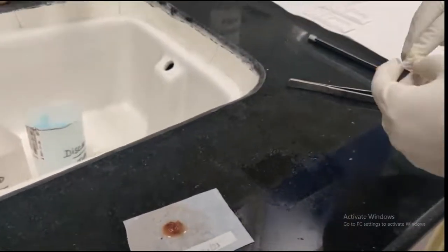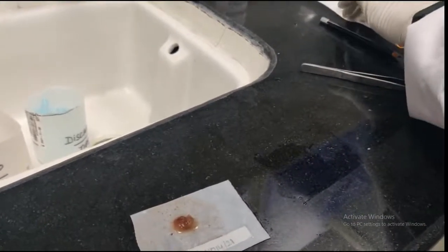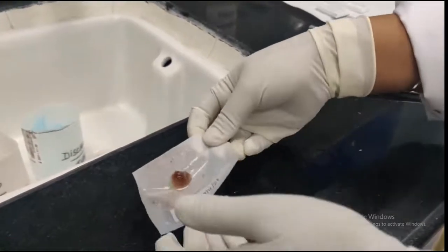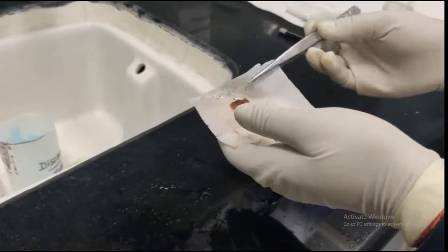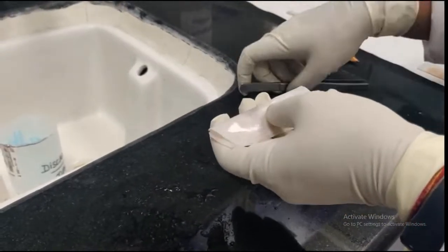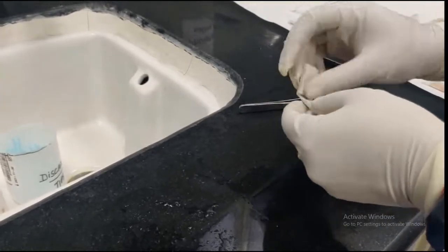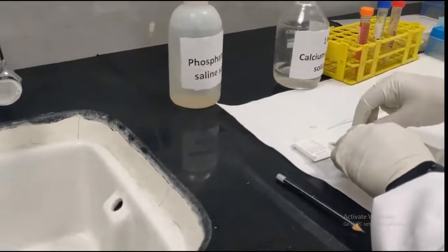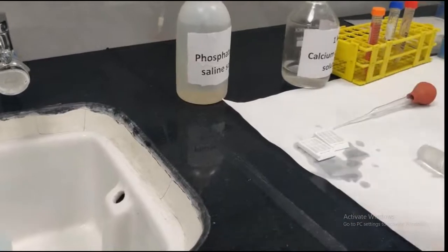We have to take care not to put these cell blocks for formalin fixation, as addition of formalin may dissolve this gel. So these will be going directly for tissue processing now in the automated tissue processor or in the manual ones, as is the availability in your laboratories. So you can see that this whole process is over in just 20 minutes.